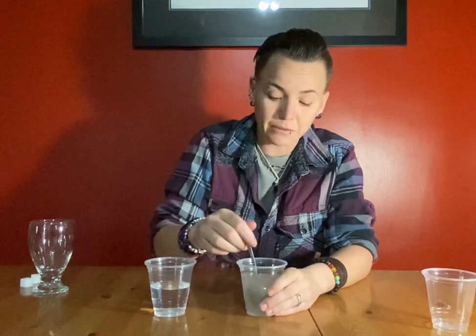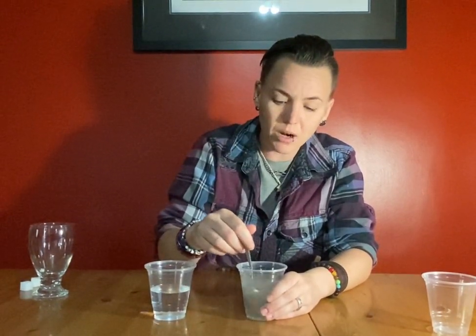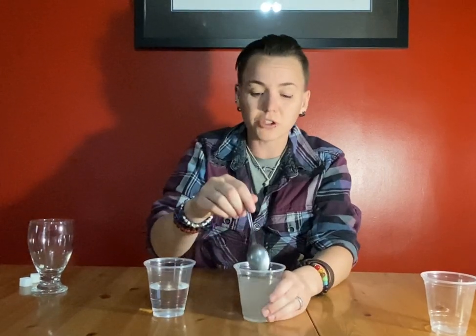There should be more mass in that tiny little cube of sugar than there should be in this water, right? Because all the particles are further apart. So we're hypothesizing that if we drop ice and a cube of sugar into these solutions, both of them should sink to the bottom because the solids are always denser, right? So regardless of your solution, if you had liquid iron for instance and dropped a cube of iron inside, it'll sink to the bottom. So we're going to demonstrate this right now.